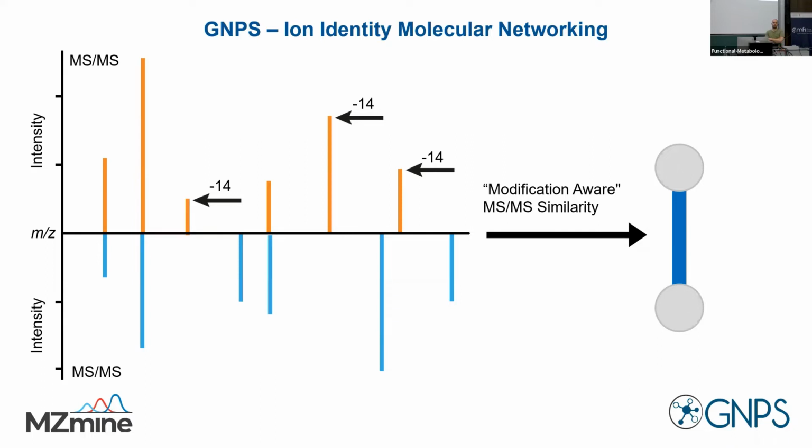Yeah. And even now I still understand this concept better after years of working with it. Just last year I realized, oh yeah, you can also explain the modification: the 14 is also a neutral loss. If you flip the spectra at the precursor, you look and see, wait, the signal is just shifted by 14.